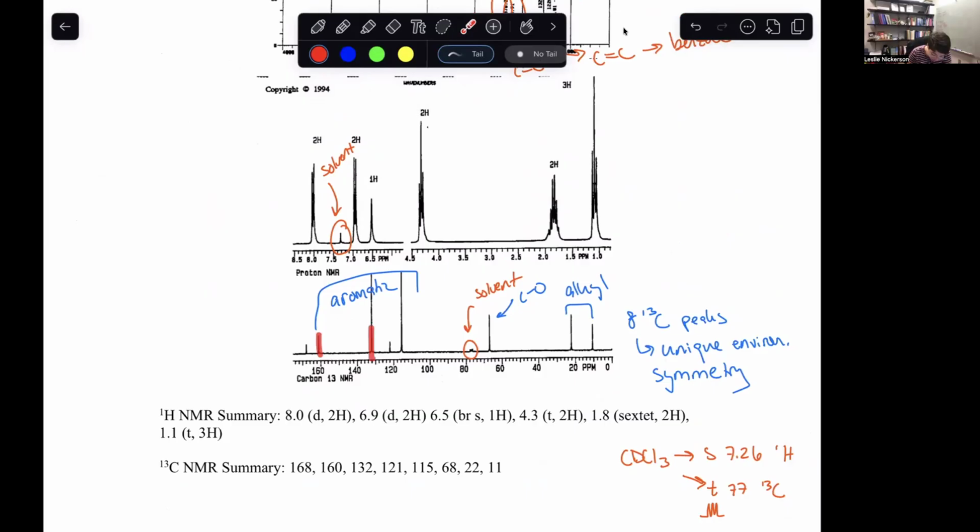When I'm looking at the aromatic region, it's pretty common to have a little bit of shuffling in and out of each side of that range, depending on what kind of things you have attached to your benzene ring. But keep in mind, because of the ring and how the symmetry on it works, it's going to be fairly common to have 4 carbon environments on your benzene.